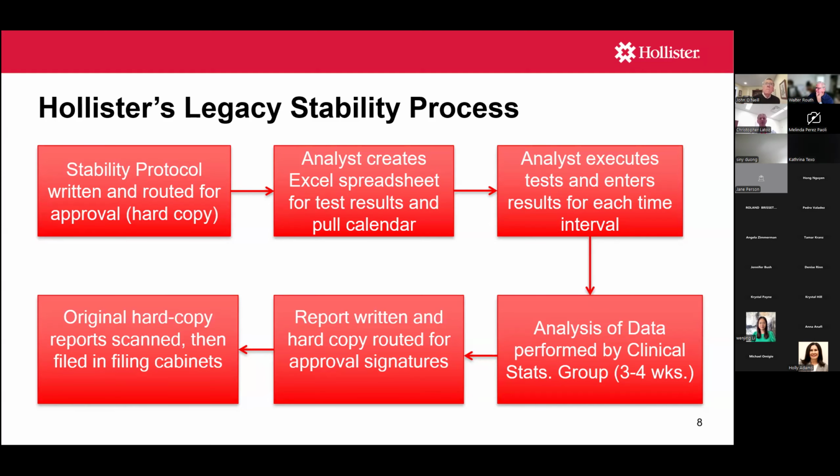Then our technicians or analysts would create Excel spreadsheets to enter their test results. They would also create a pull calendar, so to schedule pulls, they would do this all manually. Finally, the analyst or technician would execute the test, and then for each of the time intervals, they would enter the results in the Excel spreadsheet.